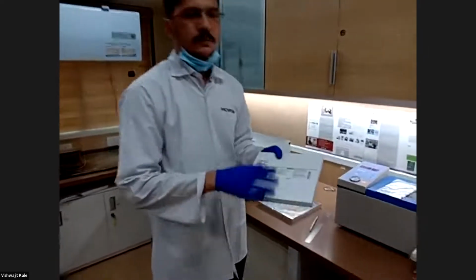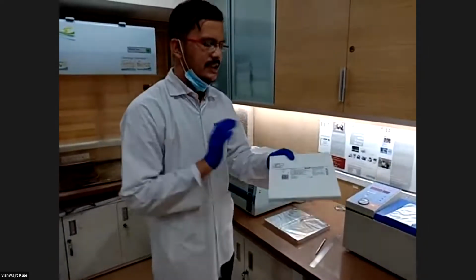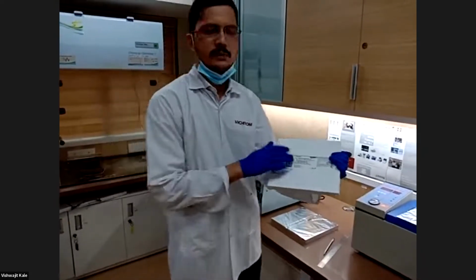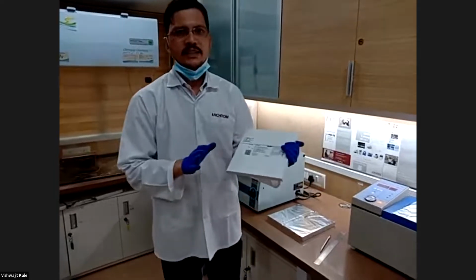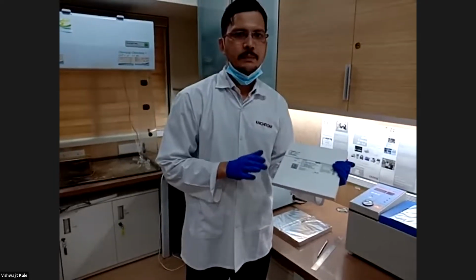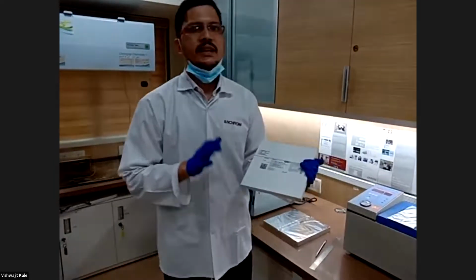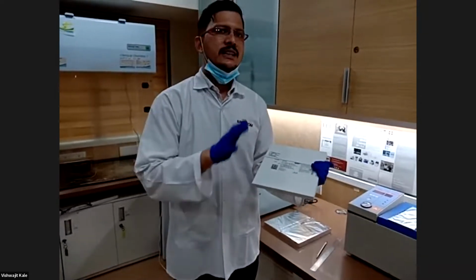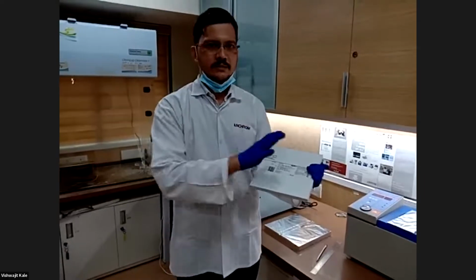So these types of boxes are there. These are plates, TLC and HPTLC plates. We are purchasing from Merck. There are different manufacturers of TLC and HPTLC plates, and I would like to say there are more than 50 different types of stationary phases available. You can select as per the chemistry of interest.